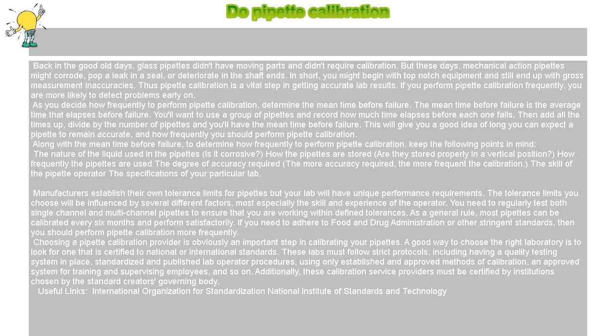These labs must follow strict protocols, including having a quality testing system in place, standardized and published lab operator procedures, using only established and approved methods of calibration, an approved system for training and supervising employees, and so on.